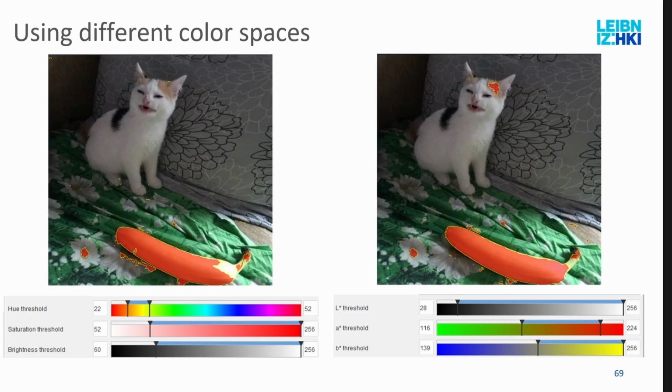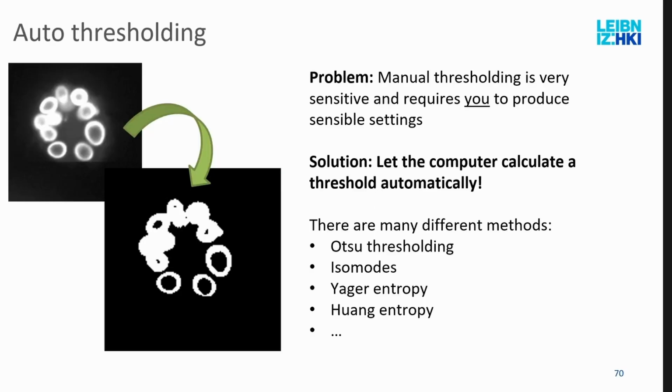It's sometimes valid for some data when they are very uniform and the auto threshold doesn't really work for you. But manual thresholding is really annoying sometimes, because you have to sit there and try it out and fiddle around. And if you get new data that has different properties, then it suddenly doesn't work, and then you have to sit there again and fix it.